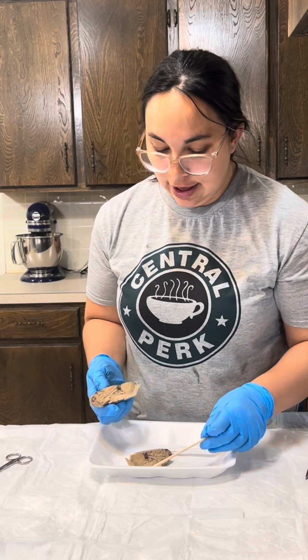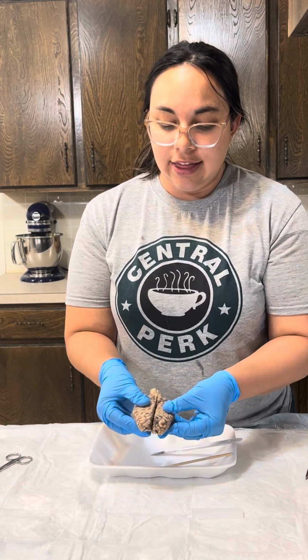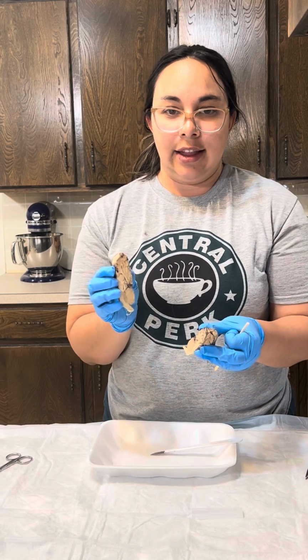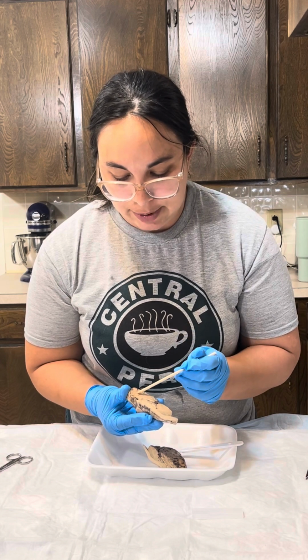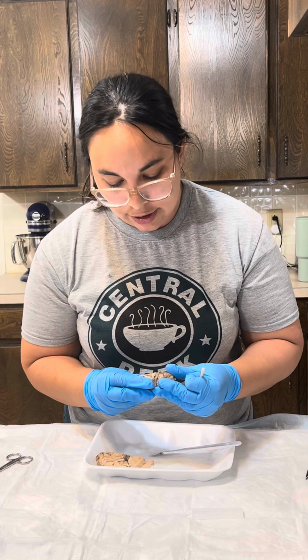And then the other part that you're going to want to see: when they were put together, there's a deep fissure, the longitudinal fissure, and eventually it comes to an end, because the left and right side of the brain have to talk to each other. They talk to each other through what's called the corpus callosum. It's this piece right here that comes at the top.